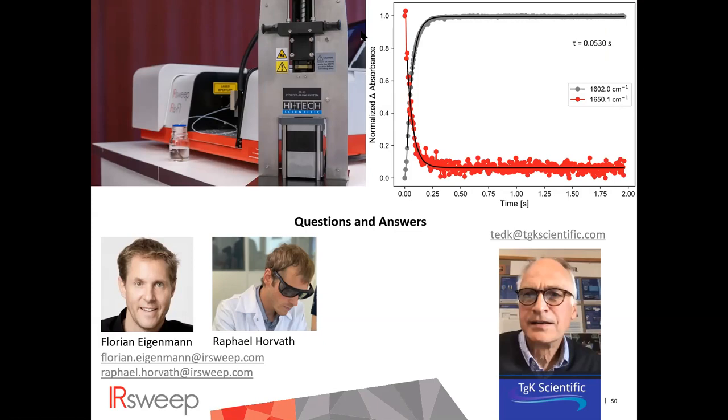Thanks to the speakers, Raphael and Ted, for this excellent webinar with some really new results, which are very promising for the near future, specifically for stopped-flow measurements, but also for other fast reaction analysis, specifically the 220 spectra per second. I think there's a lot of possibilities in the future for what you can do with dual-comb spectroscopy.